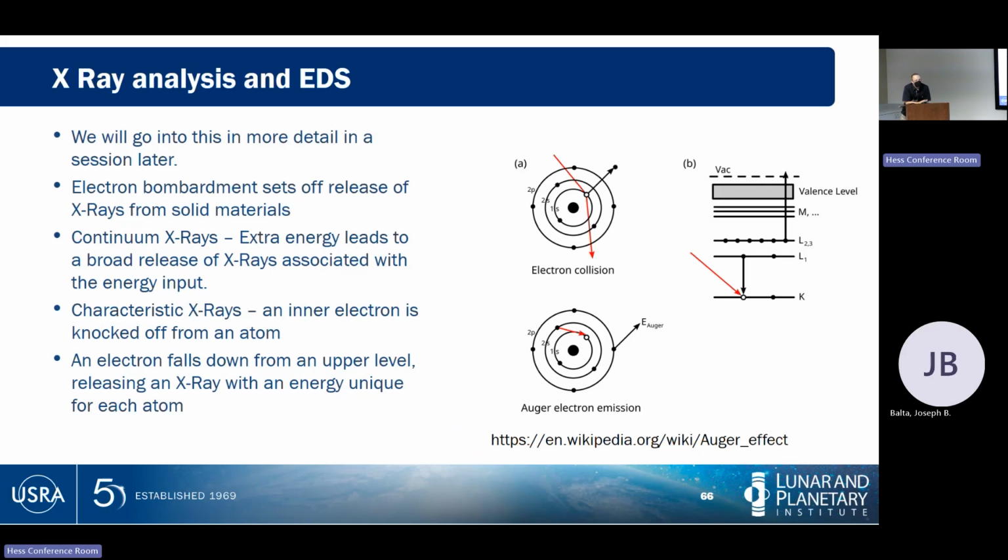All right. We have probably, what day is it? Wednesday into Thursday. I have a whole session set up for more details about this type of analysis. So we will go through this in much more detail later. But the last thing we want to cover before we turn you loose onto the SEM is X-ray analysis. This is another powerful tool of shooting electron beams at stuff.